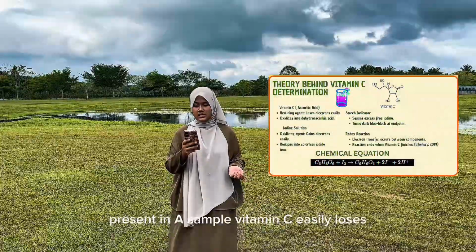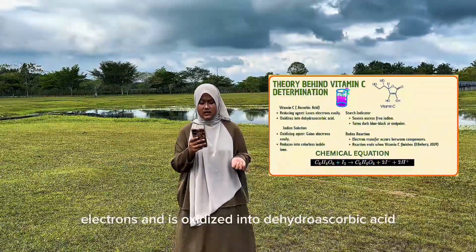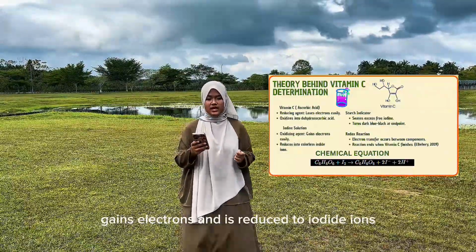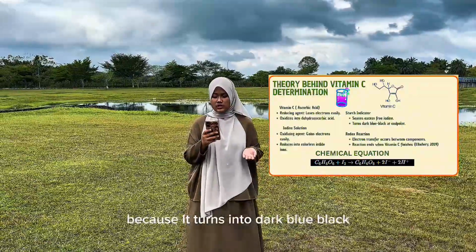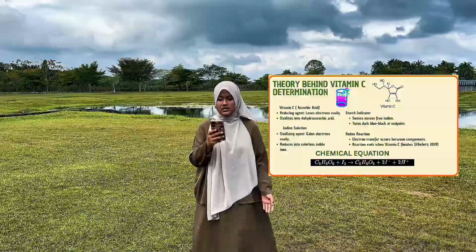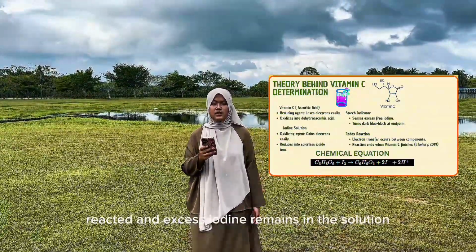Vitamin C easily loses electrons and is oxidized into dehydroascorbic acid, while iodine gains electrons and is reduced to iodide ions. Starch is used as an indicator because it turns dark blue-black when excess iodine is present. The reaction ends when all the vitamin C has reacted and excess iodine remains in the solution.